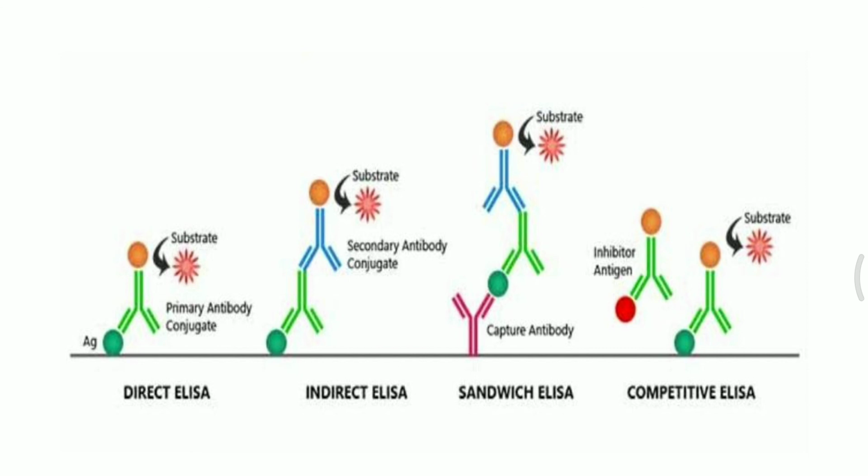And we also try to understand what kind of sensitivity each of these ELISA has. Generally, sandwich and competitive ELISA are practiced much more than the direct and indirect ELISA, but any of the processes uses the same idea, that is, enzyme is linked with the antibody which is immunosorbent. It means whenever we talk about adsorbent, it means it is just attached to the microtiter well, or it is attached to the substrate. So I hope you all have understood.